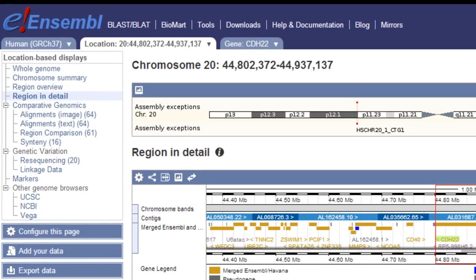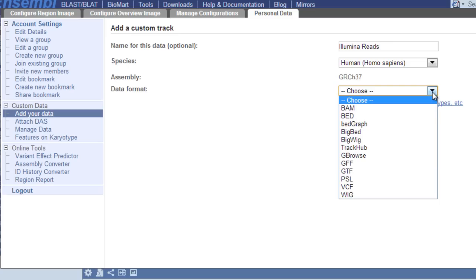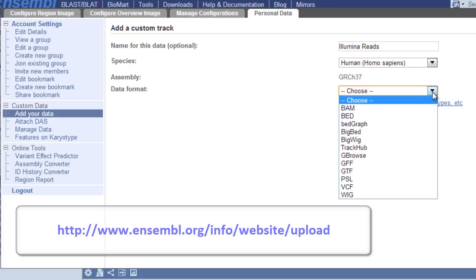Now I'll click on Add Your Data and fill out this short form. I'm going to name the track Illumina Reads. My data is for human, so I'll leave that as is. It's a BAM file, so I'll select that. You can see lots of other supported file types below — to read more about them, check out our documentation.